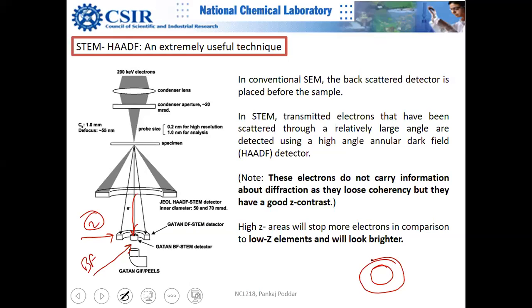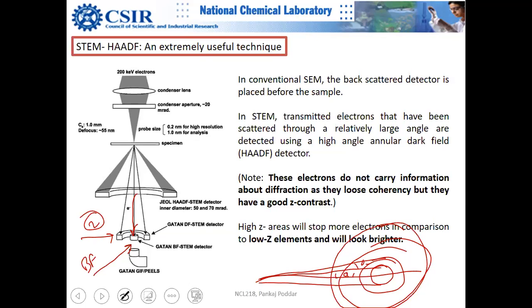If I plot a cross section, this is one diffraction angle theta 1, and another diffraction angle theta 2, right? So you cannot keep on making detectors. How do you manage this engineering problem? I will tell you later on, not now. But I thought that someone out of you will ask this question, that this detector is only kept at one angle theta, but how are you detecting other angles?